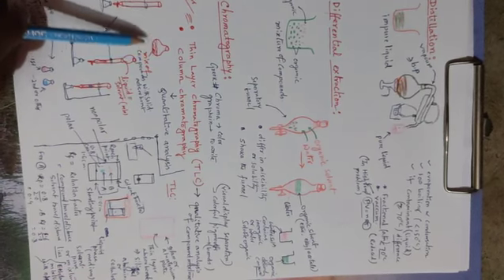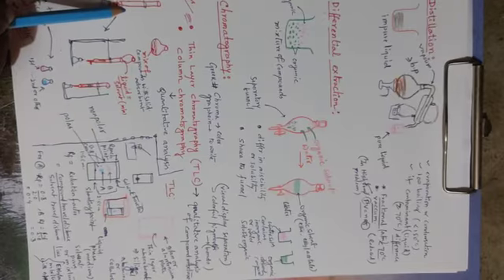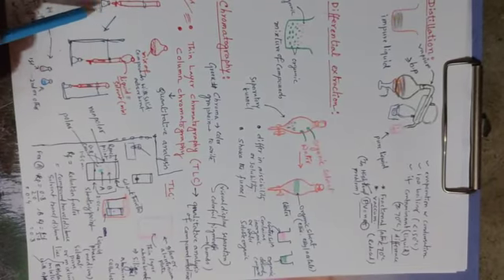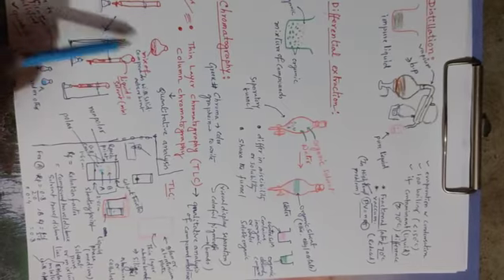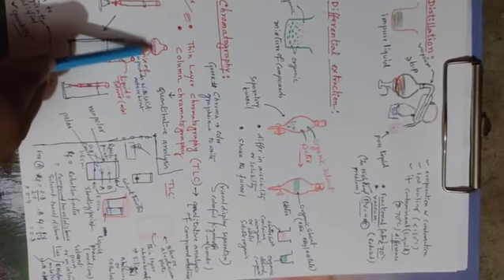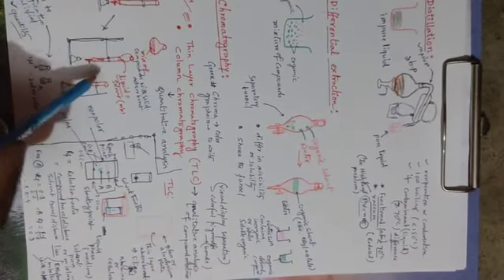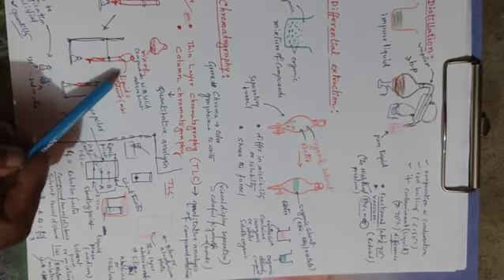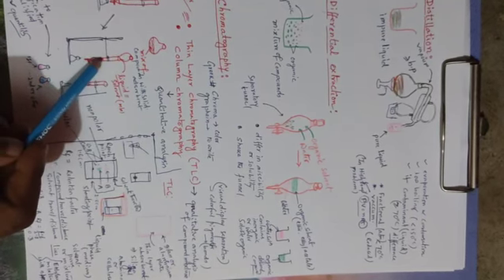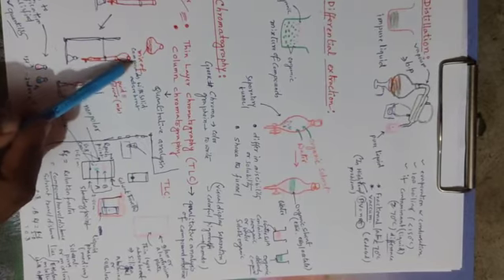Now we will come to column chromatography. To do column chromatography, we need a column, in general a glass column, with some hollow space. There we need a mixture of compounds already adsorbed onto silica gel or alumina, mixed with that to make it free-flowing. First we put some stationary phase, normal silica gel. After that we put the sample mixture here, and then over that we put the mobile phase.